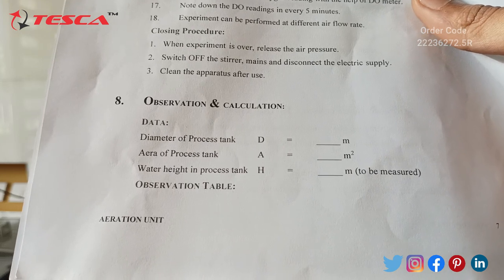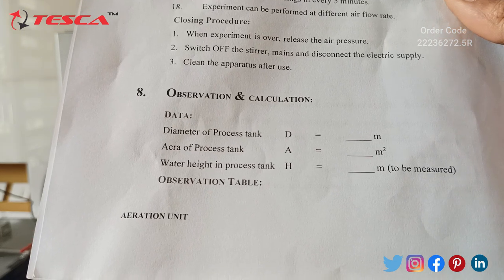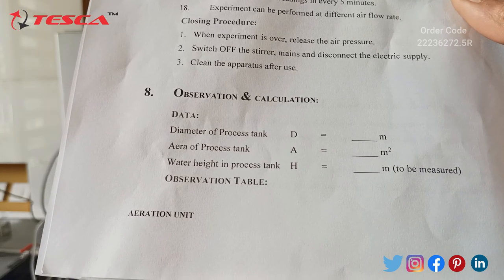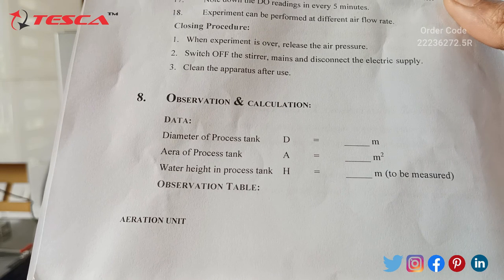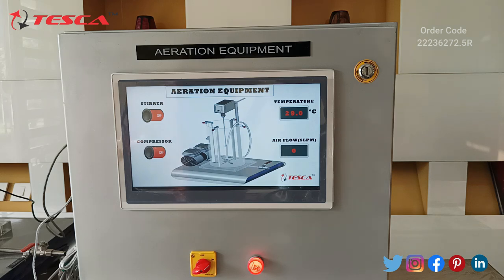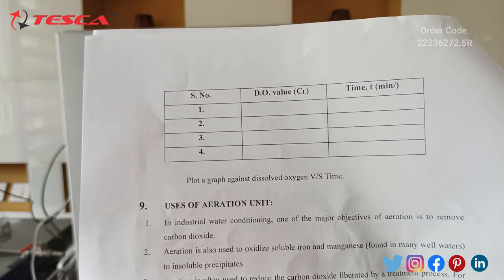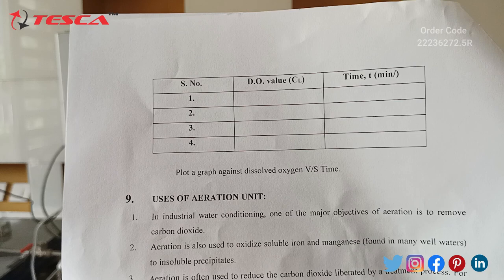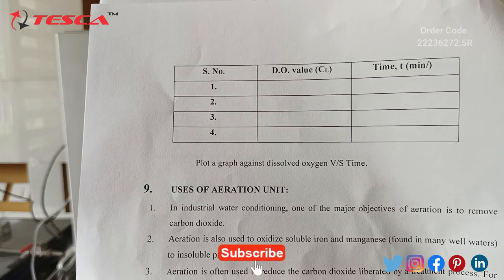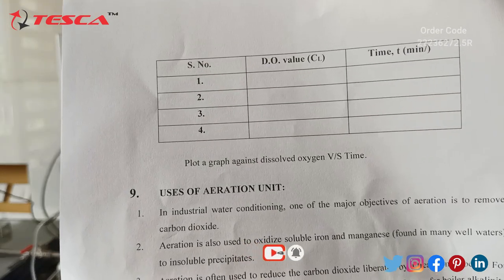Now for observations and calculations: you can see we have to measure the diameter of the process tank in meters, which you can measure manually. Same for the area of the process tank and the water height in the process tank — all these measurements you have to take manually. For readings, we have to measure the DO value from the DO temperature meter and also note the time manually. You should take 4 to 5 readings at every 5-minute interval, and form the observation table accordingly.